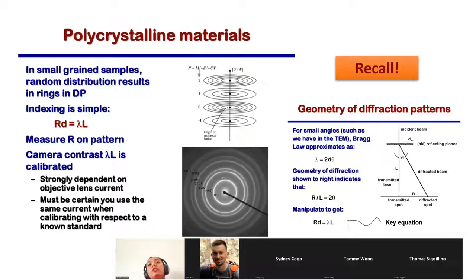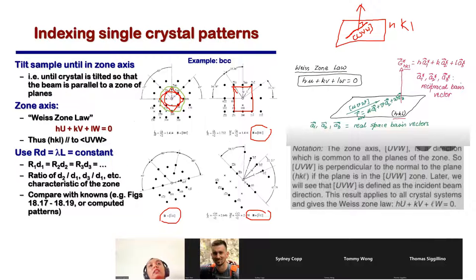You have to be very careful, but there are ways where you will see some of the spots, and if you change this diffraction pattern, you will see some of the spots are a little bit brighter than the others because the diffraction is happening a little bit higher from there. You would know the position of 110, some spots which are maybe of a little bit higher intensity, and you can literally deconstruct these entire rings into the single crystal.